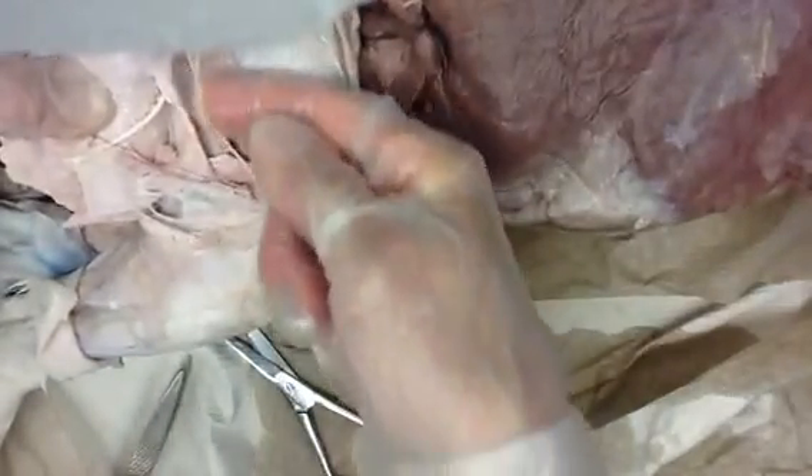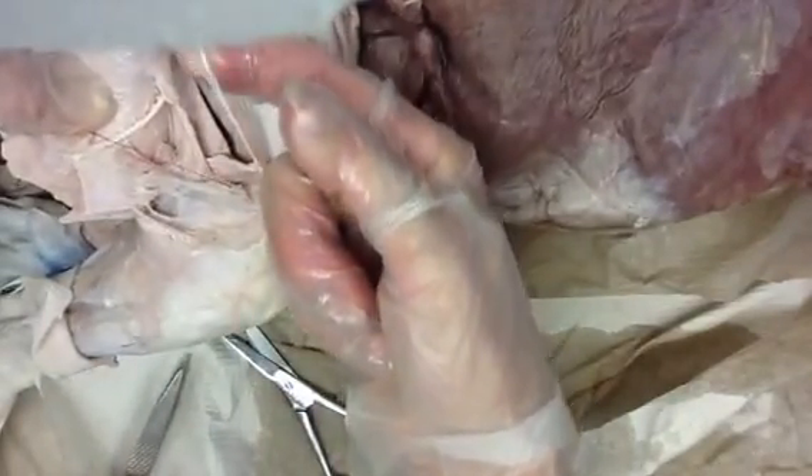I'm going to cut some more and pull that back. Now here — is that a nerve or is that a tendon? Look where it's attached. Shiny — that's shiny, and it's attached to some muscle. I snipped it a little bit. It was already snipped if it makes you feel any better.